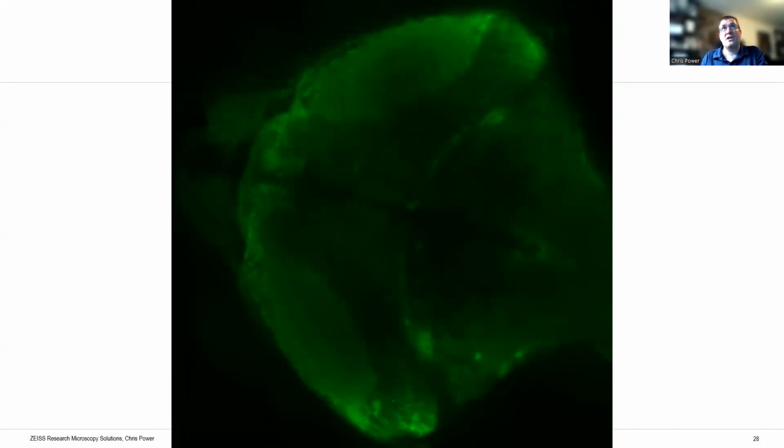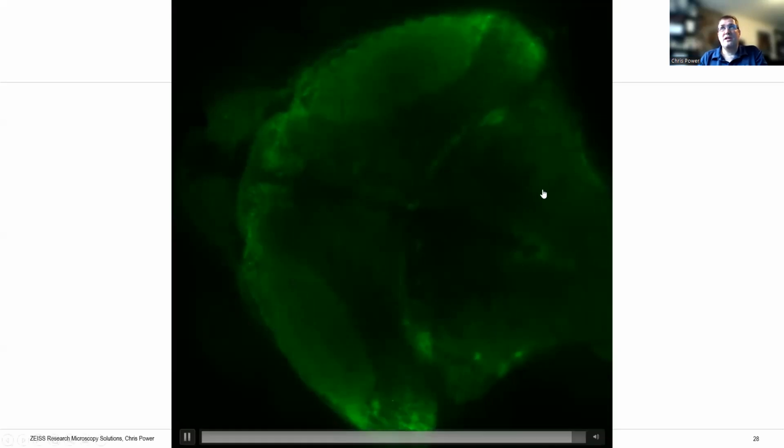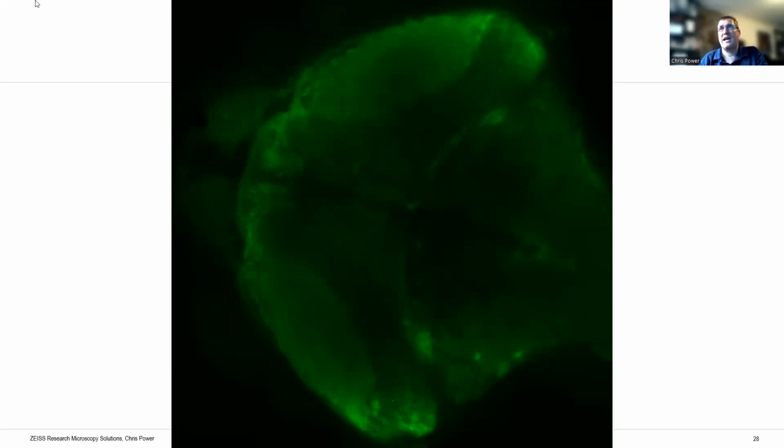That was mainly about the fact that you're doing parallel illumination and therefore you are so much more gentle. So that was when we realized this is really, really powerful, especially if you're used to confocal with the noisy kind of scan as we go here.